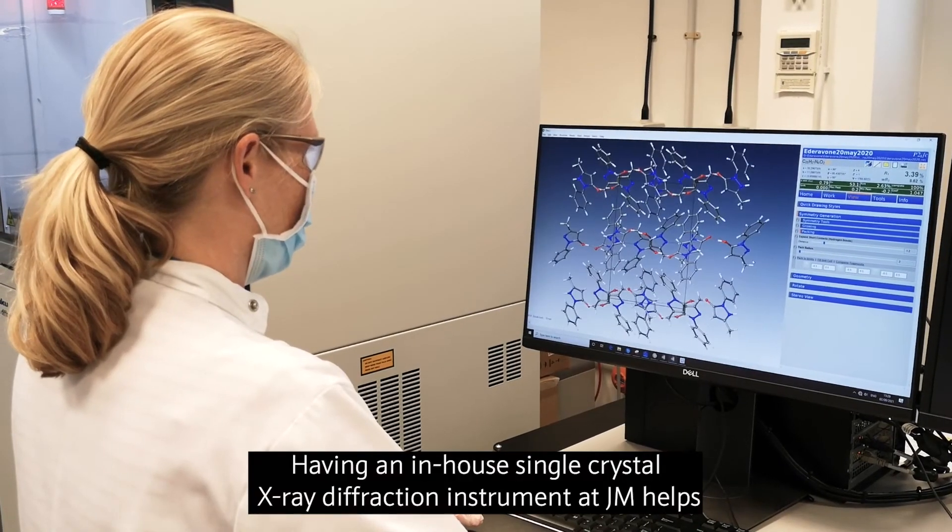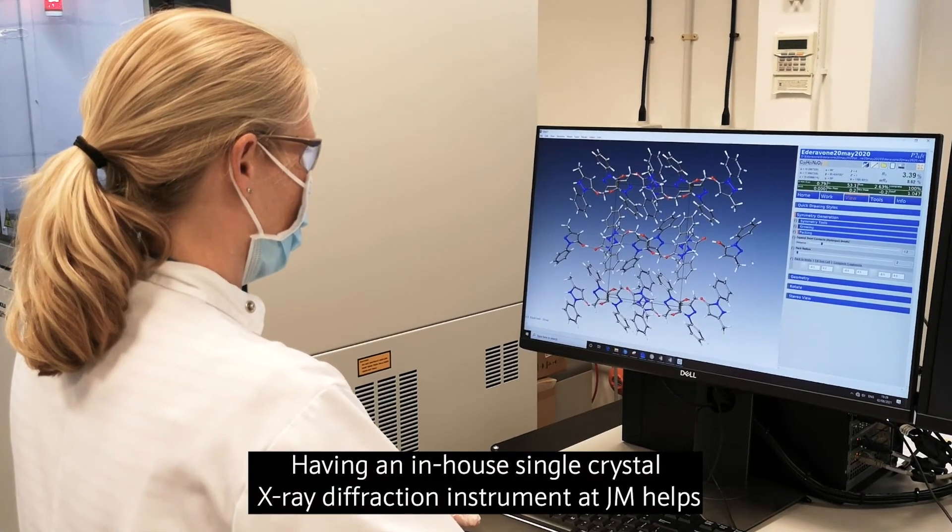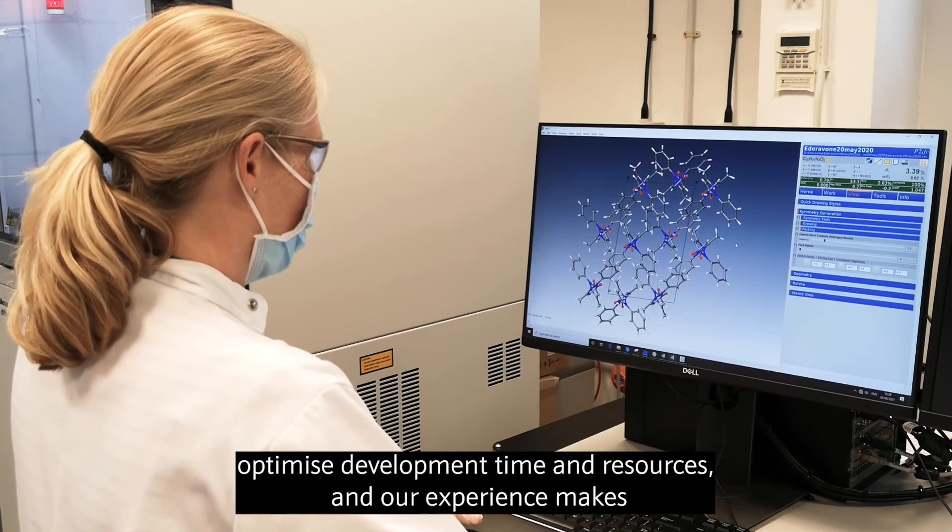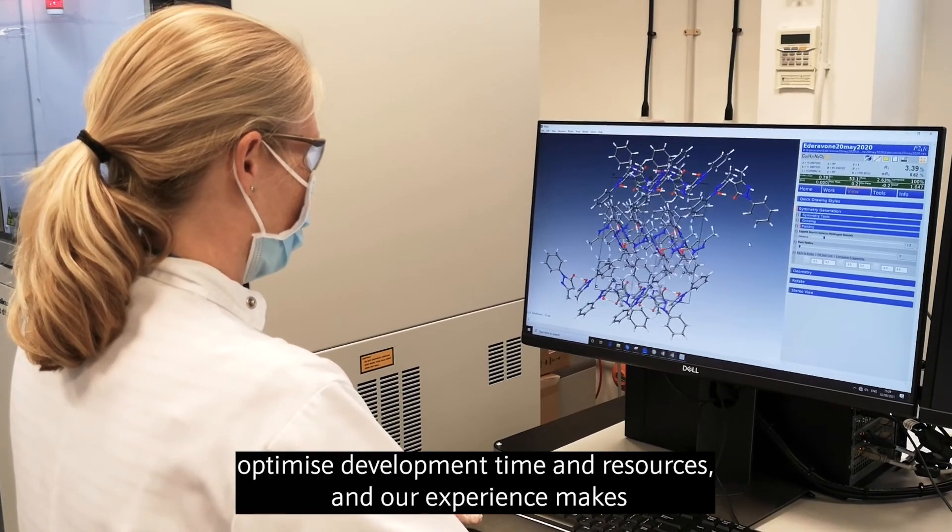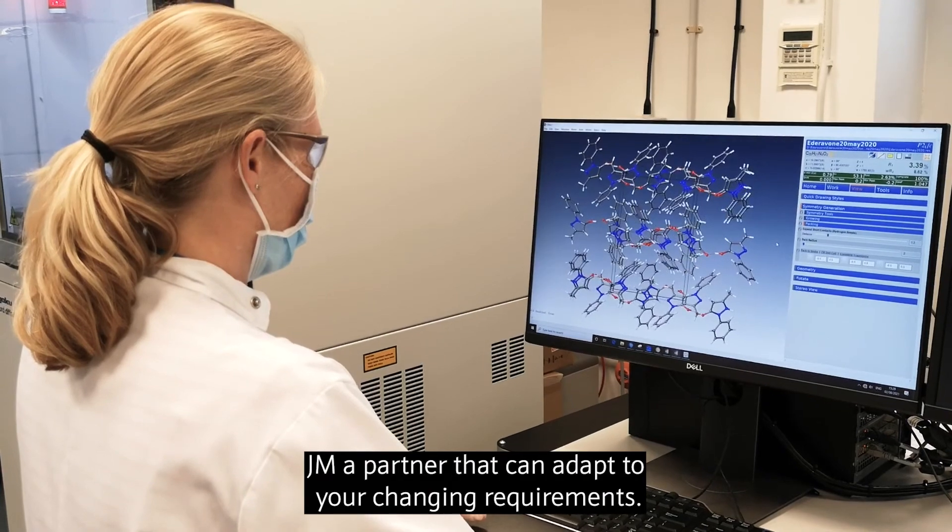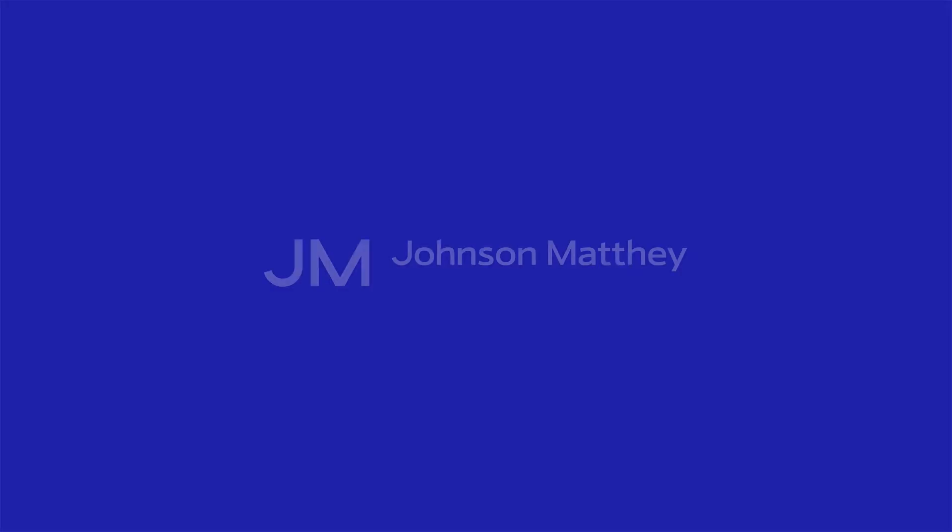Having an in-house single crystal x-ray diffraction instrument at JM helps optimize development time and resources, and our experience makes JM a partner that can adapt to your changing requirements.